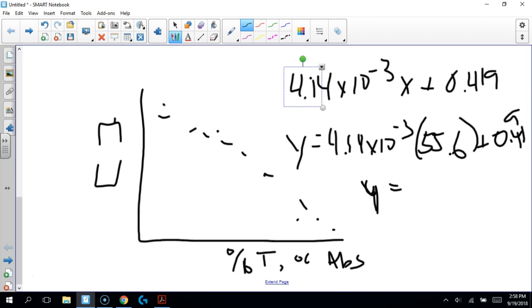Okay, and so all of this gets us to being able to determine the concentration of our unknown. Now at the end of this, you should be able to look at that number. And I think the number that I get in this is somewhere around 0.18. Now you're going to have to carry that out to more significant figures, right? That's the whole point of doing this, so that we have enough significant figures to be scientifically reasonable.